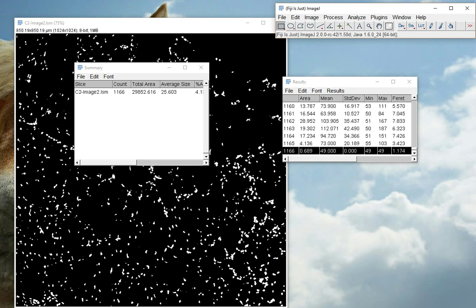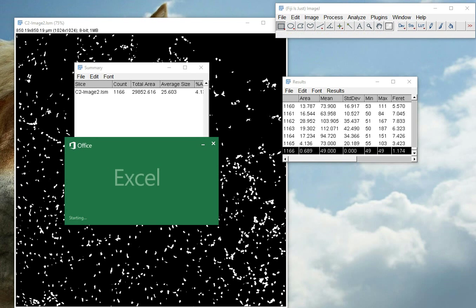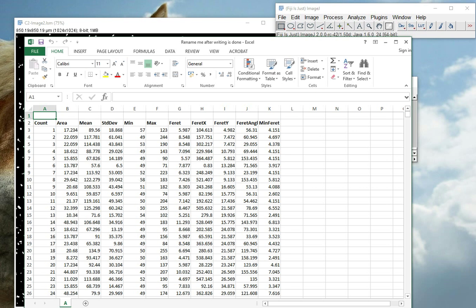So if we go to our desktop now, there is a new file entitled Rename me after writing is done. We'll quickly open that to see what has been created.